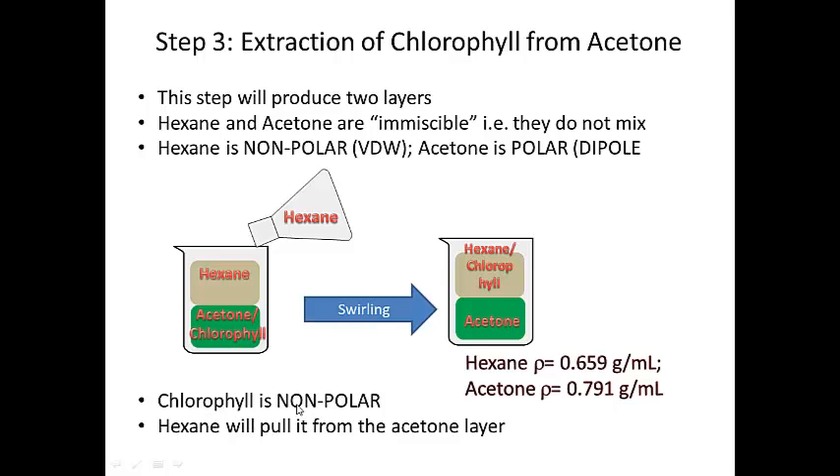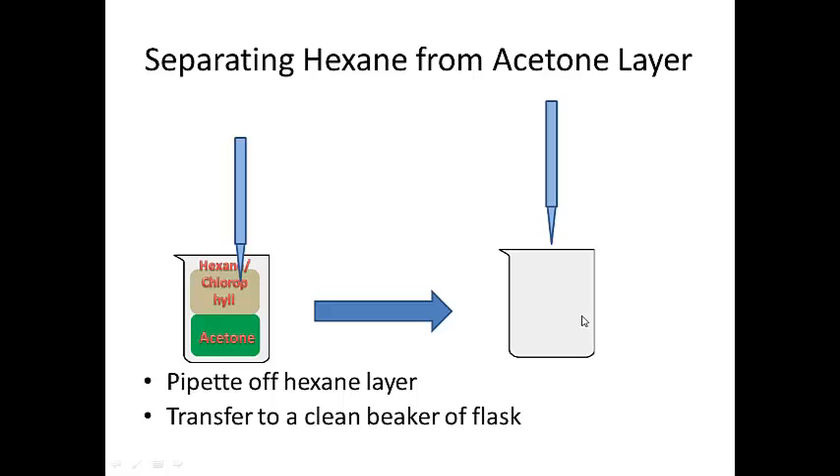Chlorophyll itself is nonpolar, so it's going to be soluble in hexane — like dissolves like, and hexane is nonpolar, so is chlorophyll. After swirling and letting the layers separate, you pipette off the hexane-chlorophyll layer and transfer it into a clean beaker or Erlenmeyer flask. Now you have your chlorophyll layer.